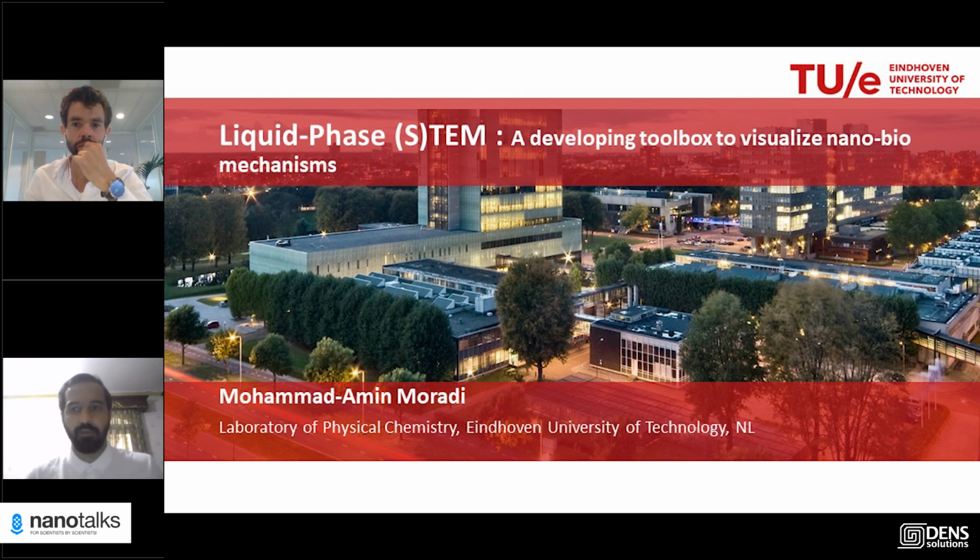So one of the important damages we see in graphene cells is the bubbling of the sample, because it gets heated very quickly. Not with single-layer graphene.